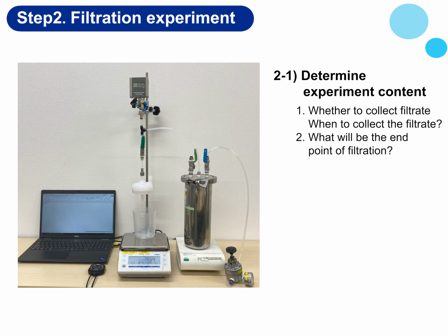The filtrate can be collected at various times, such as only at the initial stage of filtration, at several points at fixed processing time intervals to check for changes, or after filtration is completed and all accumulated filtrate is analyzed. Set up the system according to the purpose of the experiment. The endpoint of filtration is generally determined by the time required to pass a liquid through one type of filter or when the filtration flow rate has decreased to a certain degree.